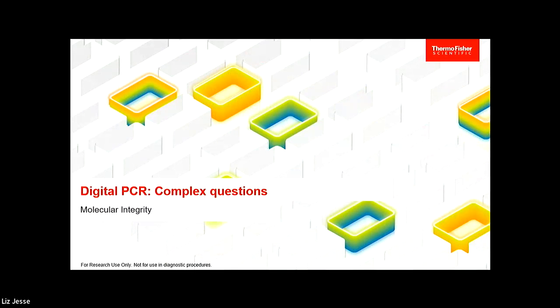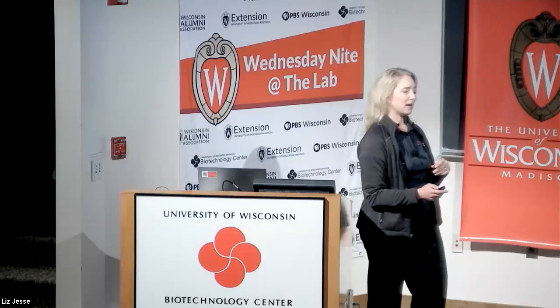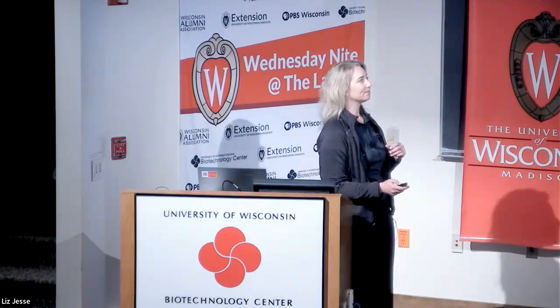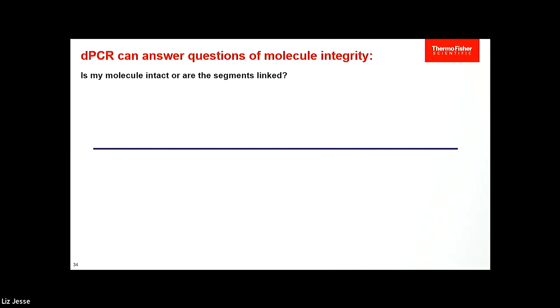All right. Now, complex questions. This is something that we've run into. It wasn't one of the original applications of digital PCR, but it's a unique application if you're curious about molecular integrity. So envision you have a molecule and you're not sure whether it's degraded or not. I will use a scenario in which a lab over on the East Coast was working with some viral targets, and they wanted to know whether the sample was degraded or if it was still intact and active.